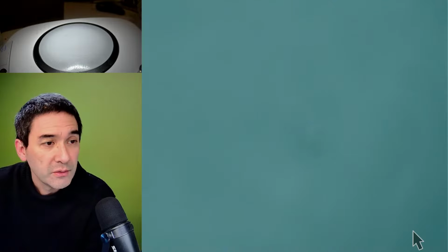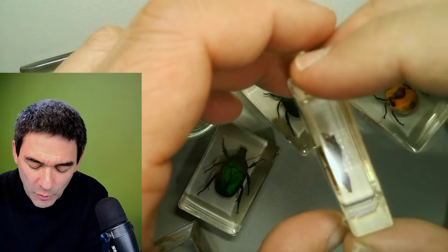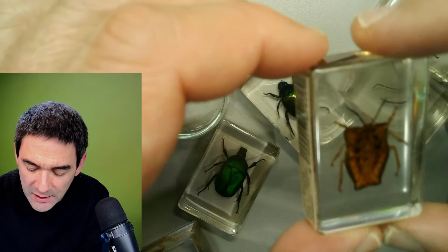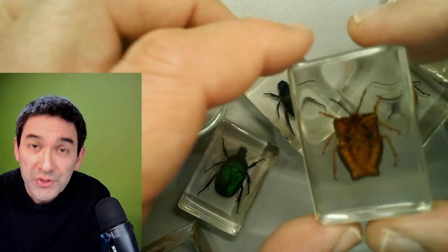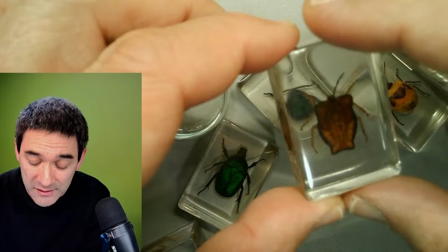Concerning specimen preparation, what I'm doing is maybe to make these things myself at home. But whatever specimens you use, they have to be completely dry, because otherwise, if they're not completely dry and properly preserved, you're going to enclose them, and any bacteria that might still be in there might start to decompose them, and anaerobic bacteria will produce methane and carbon dioxide as decomposition gases, and then you've got bubbles and all these things.